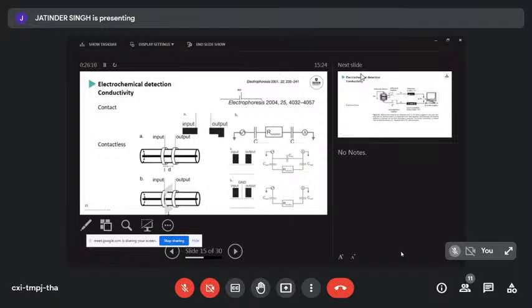We can actually see that we've got the fluid resistance, the electrical resistance of our solution, in our electrical scheme here. So we've got an AC signal that's applied to the input electrode. We've got the capacitance here in the wall that's just taking a little bit of our signal away. Then we've got the electrical resistance of our solution that connects the input with the output.